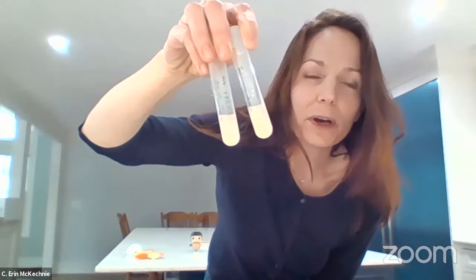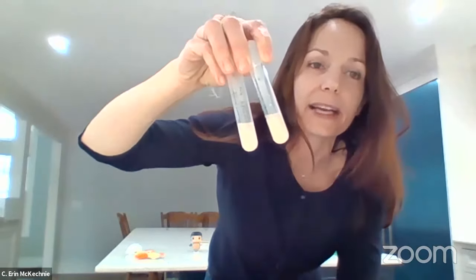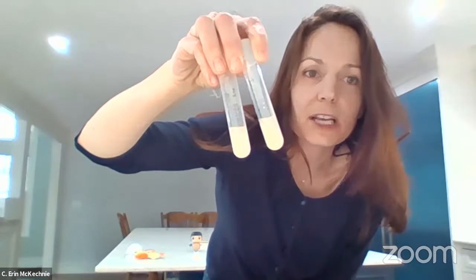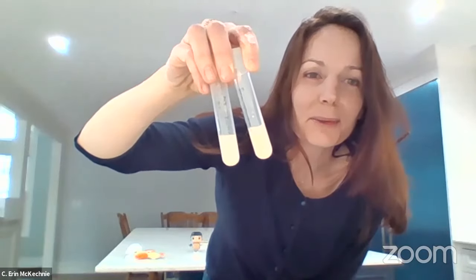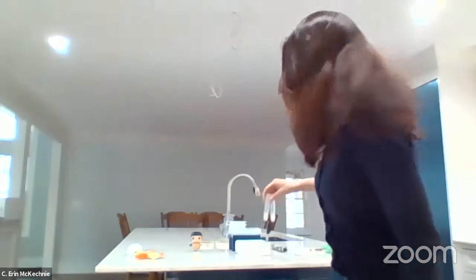In fact, what often happens in the lab is that it's possible for the bacteria to get mixed up or mislabeled sometimes. So I'm going to show you a fun experiment where we can identify which bacteria is in which tube using some antibiotics. So have you guys heard of antibiotics before?